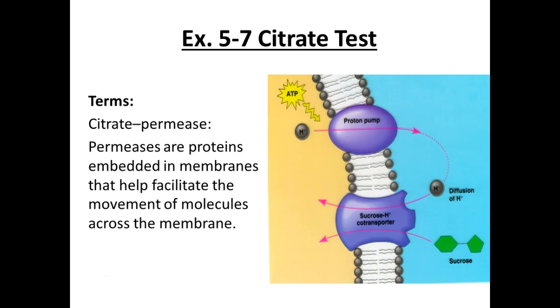Catalate, not catalase, not yet. Citrate. Right? This test is actually testing for a protein embedded in the membrane of your bacterial cells that has the ability to transport citrate from the media into the cell. This protein is called citrate permease because it acts as a port.